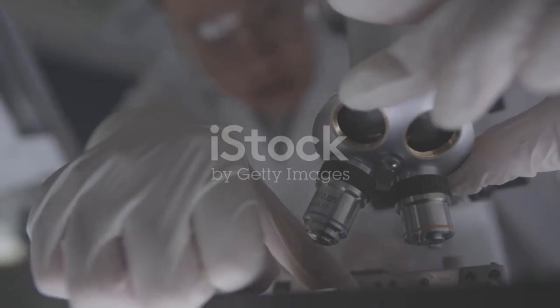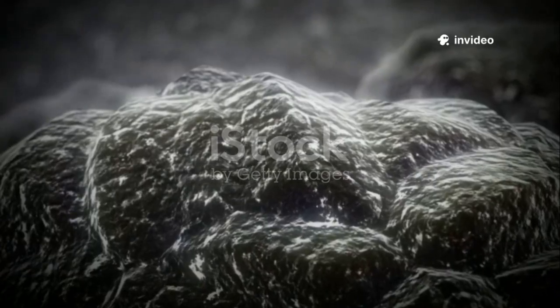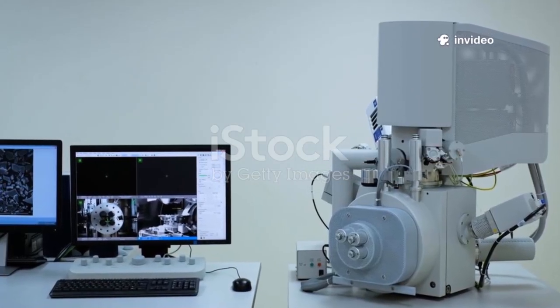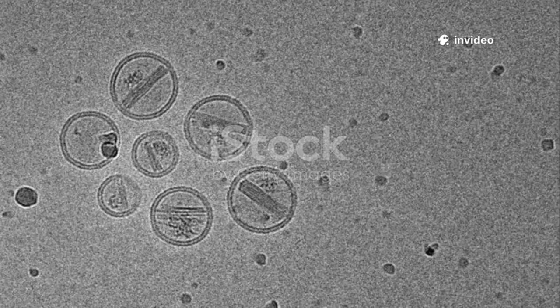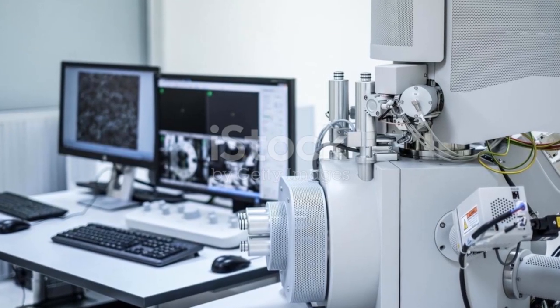Imagine you're trying to study nanoparticles, those super tiny bits that are everywhere from medicine to makeup. Regular microscopes just can't cut it. Enter SEM, or scanning electron microscopy. Instead of light, SEM uses a focused beam of electrons to scan the surface of your sample. These electrons bounce off and give us insanely detailed 3D-like images down to the nanometer scale. Not only can you see individual particles, but you can also measure their size, shape, and even spot how they're grouped together. Want to know what your nanoparticles are made of? SEM's got you covered with elemental analysis, too.